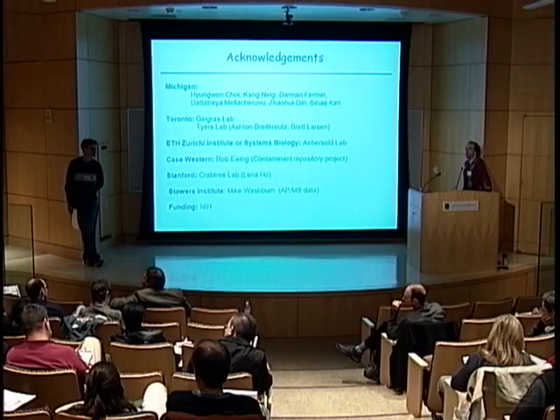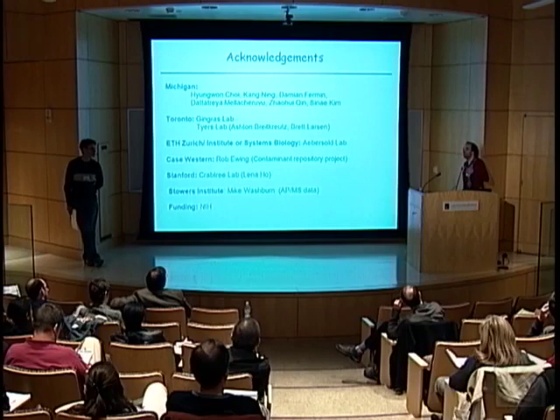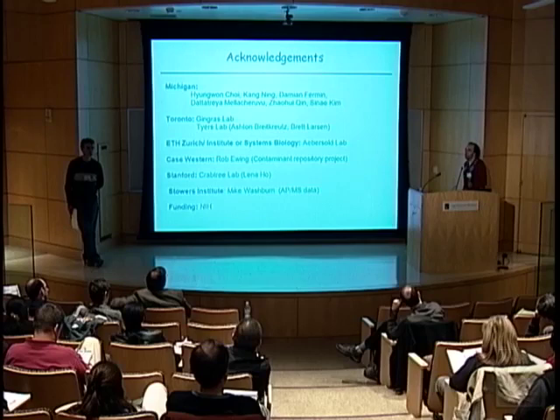Well, yes, we are. For example, for MS1 data, we'll be using non-parametric methods. If instead of spectral counts you have MS1 ion current-based quantification, we're not sure what kind of distribution we're going to see, so we are prepared to use non-parametric methods, which are always more pain than parametric methods like Poisson. So when you can avoid them, that's great.